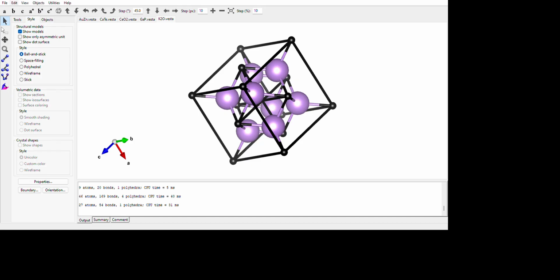Now similarly we will look at the bonds of it, and in the bonds, this is the potassium oxygen bond, or this is the oxygen oxygen bond, and we can change or edit this bond also. Apply. Similarly, this for the CeO2.